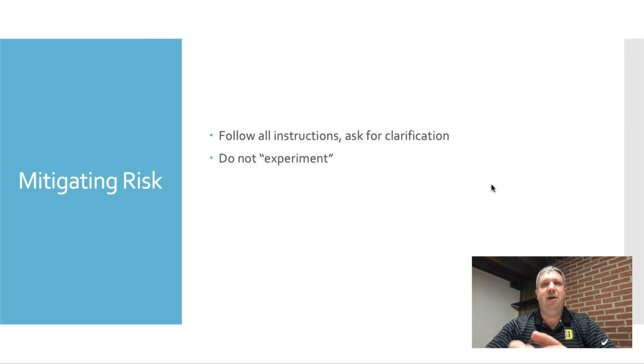Do not "experiment," and I put that in quotes. We do laboratory experiments, but don't say, hey, I wonder what happens if I mix these two things, if you don't already know what will happen when you mix those two things. Don't do unauthorized playing around. Don't put things together if you don't have a good idea first of what's going to happen, and that you're prepared and have the right equipment and the right procedures to do that. Don't just double amounts for the fun of it. Some things are very manageable in small amounts, but if you put too much into the container, it can go out of control. So don't do unauthorized experiments.